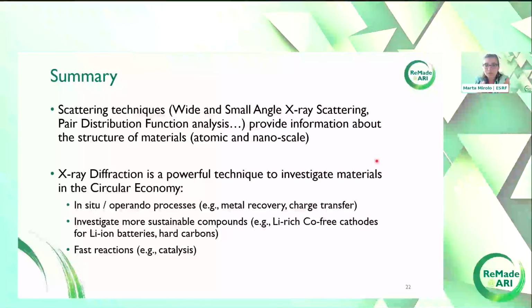X-ray diffraction is particularly useful in the circular economy, and we have plenty of examples. We can look at in situ and operando measurements. So you can look at how your metals are being recovered in real time. You can look at the charge transfer, so how your material is evolving when you take your recovered electrode and look at how it lithiates or sodiates in real time. You can look at more sustainable compounds, for example these lithium-rich cobalt-free cathodes, but also sodium-ion batteries, and then you can look at fast reactions in catalysis, in synthesis, and so on.